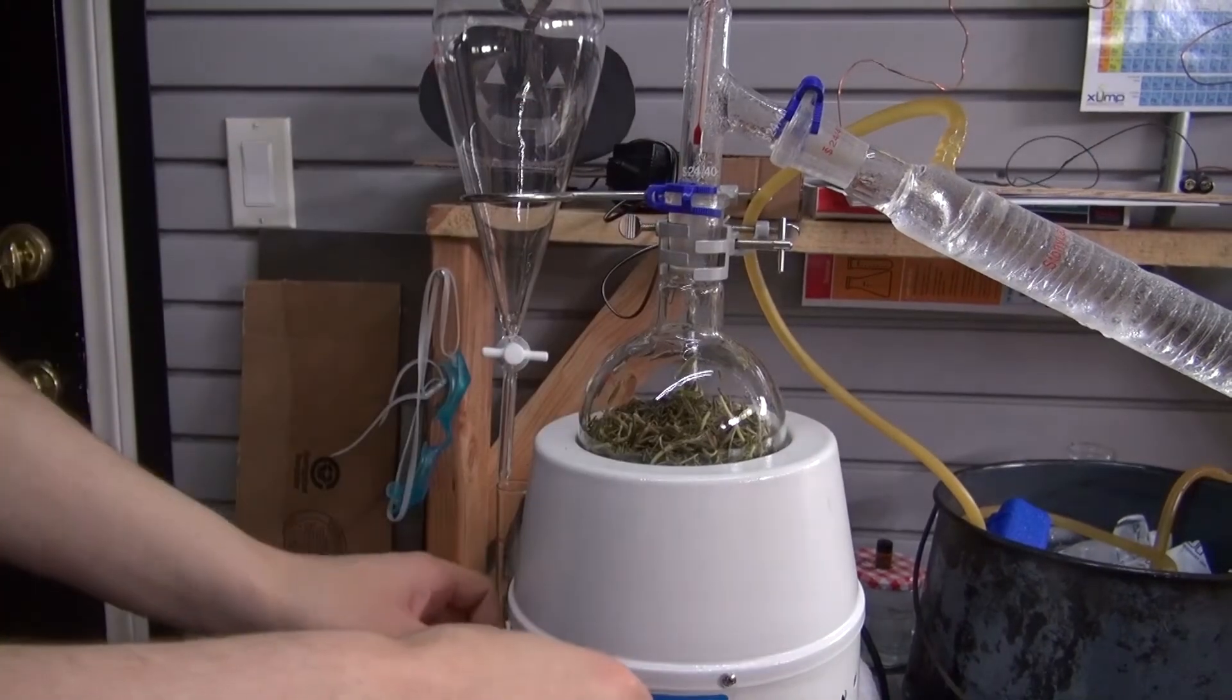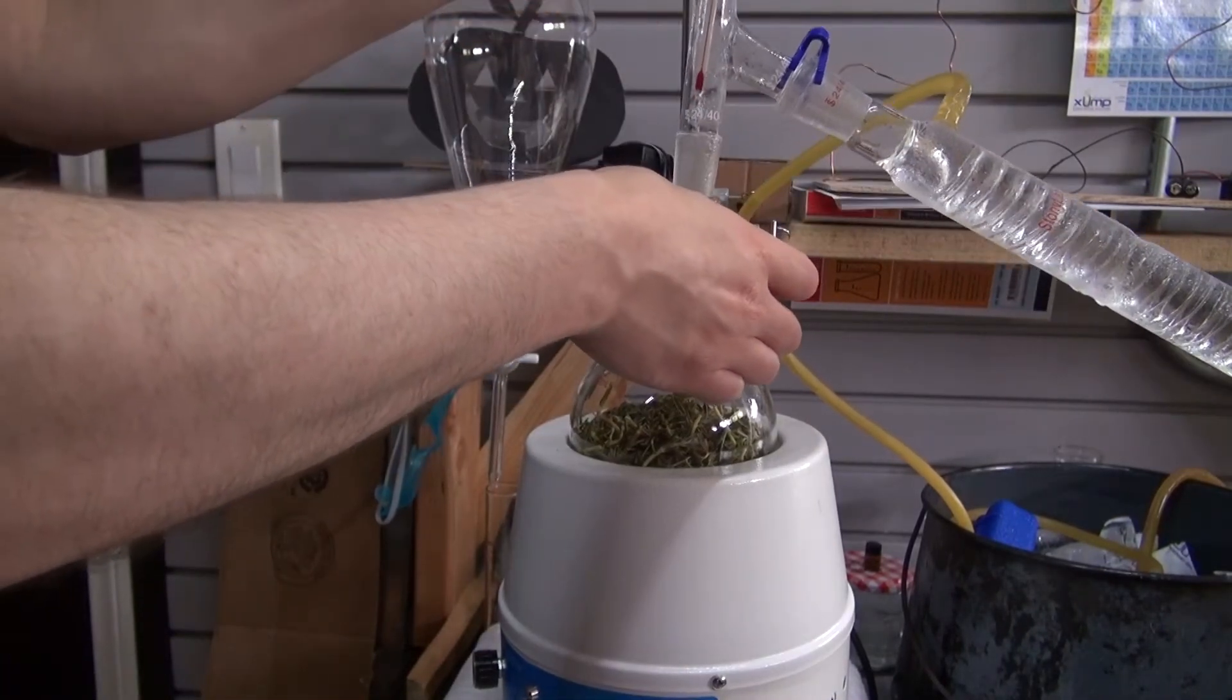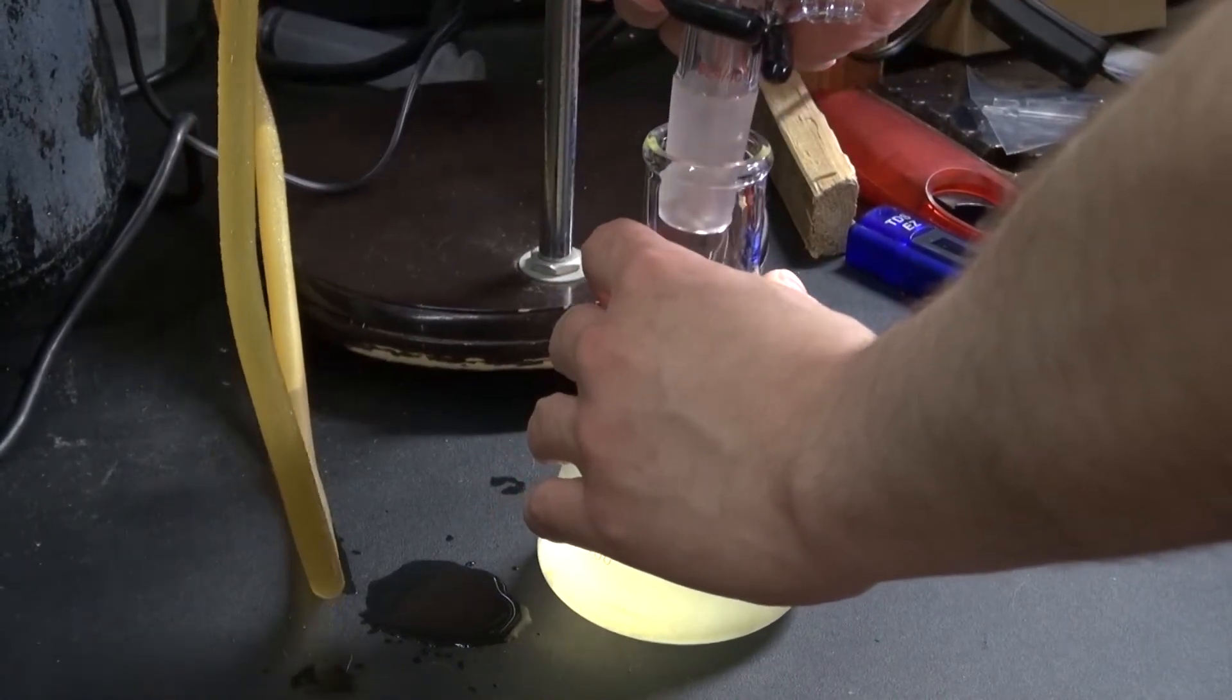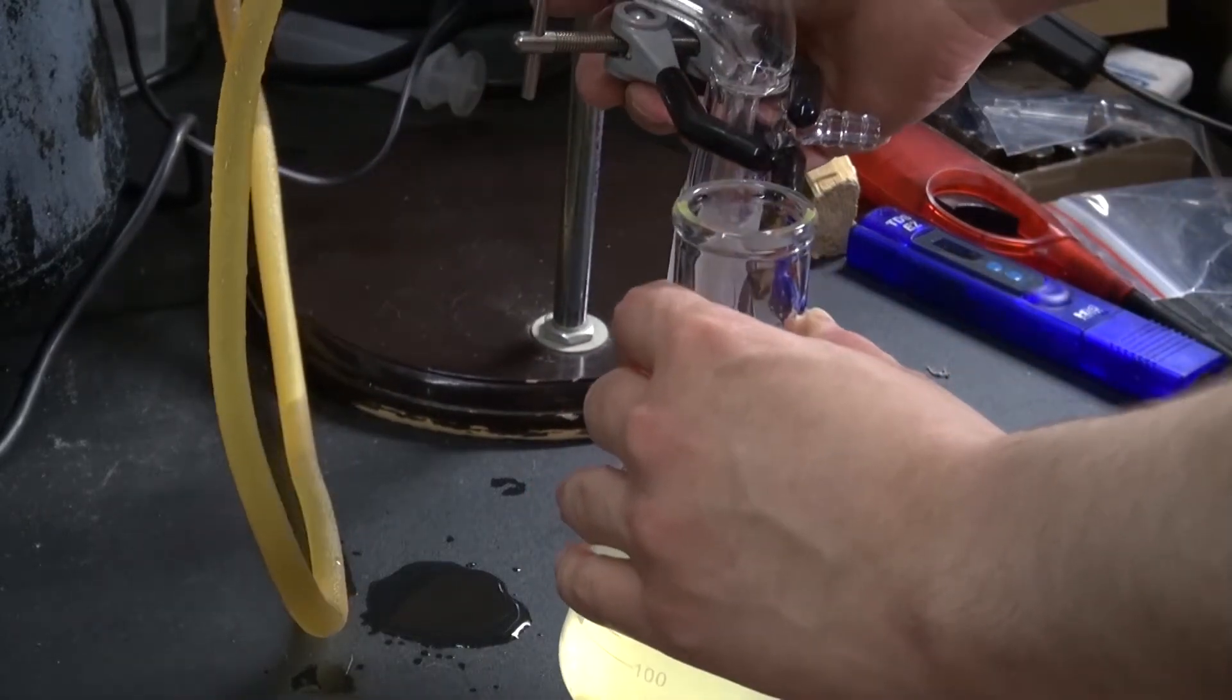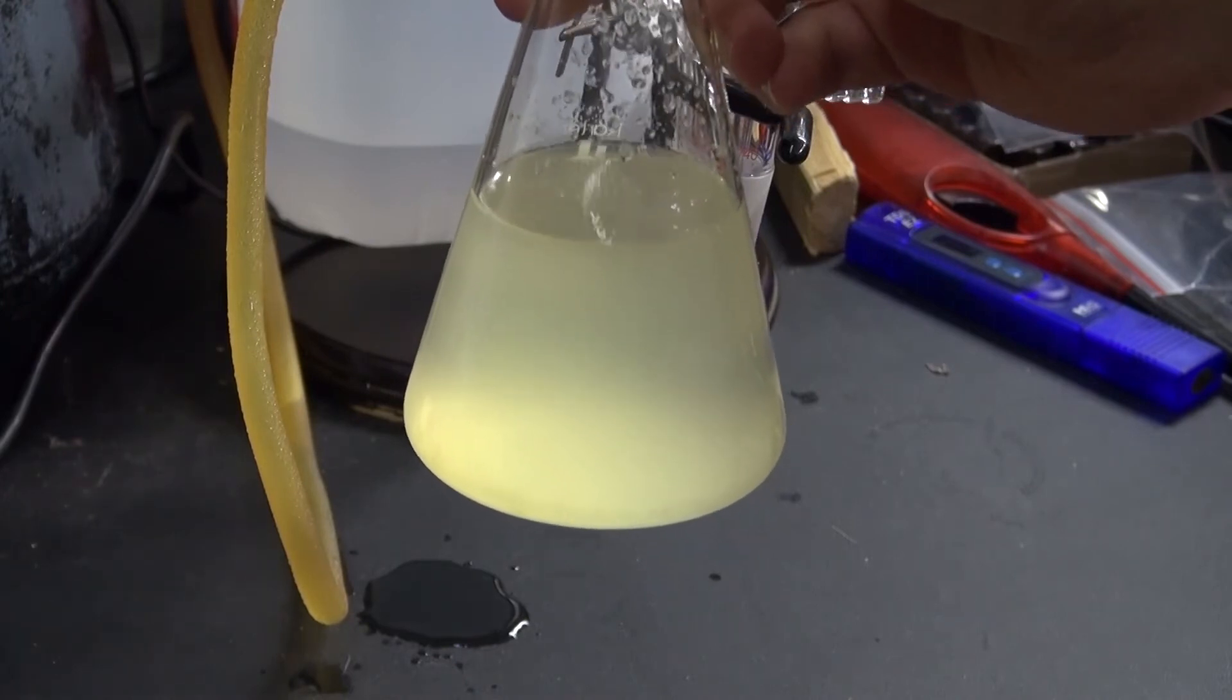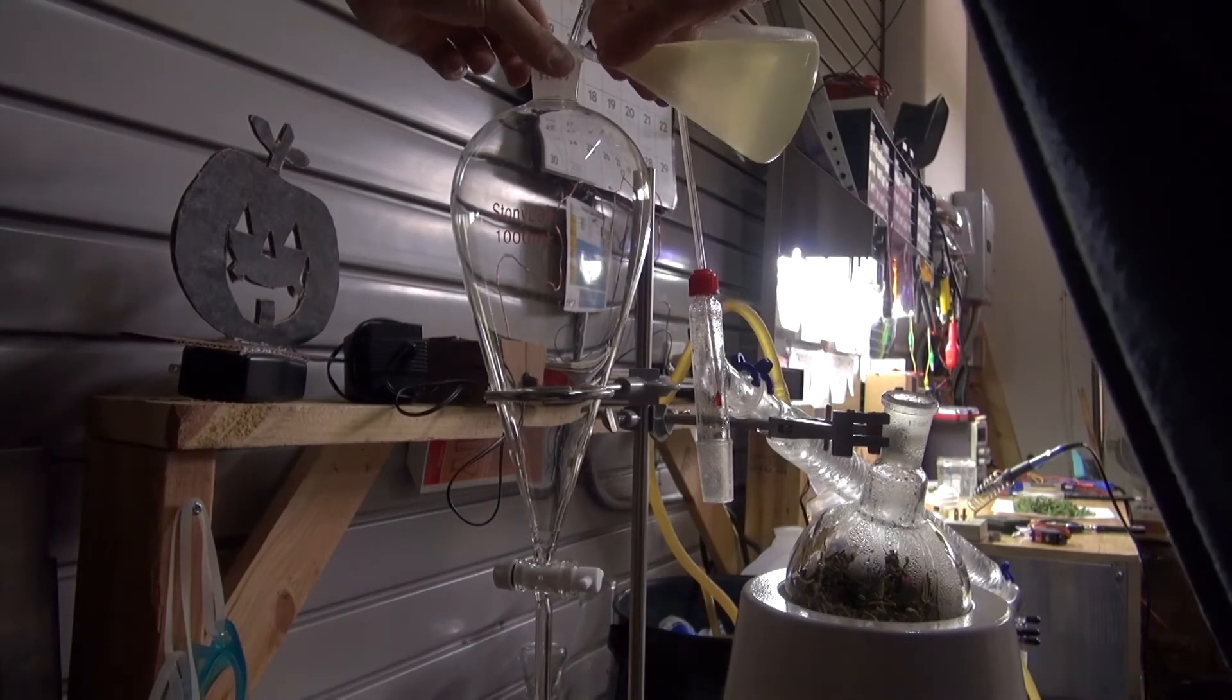So what I'm going to do is turn off the heating mantle, detach the joints. Next I'm going to remove the Erlenmeyer flask that contains my result. This is what the final product looks like of the rosemary hydrosol and essential oil. It still looks very contaminated to me. So I'm going to pour it into my separatory funnel, let it sit for a little while, and then see what kind of results I get.